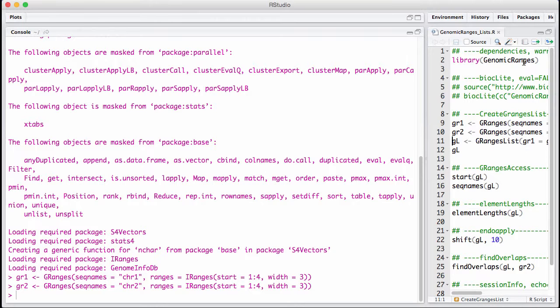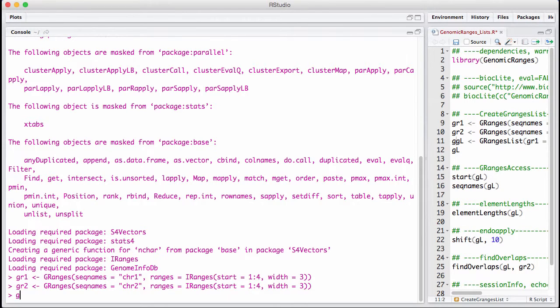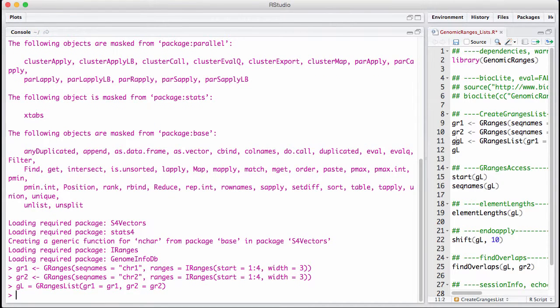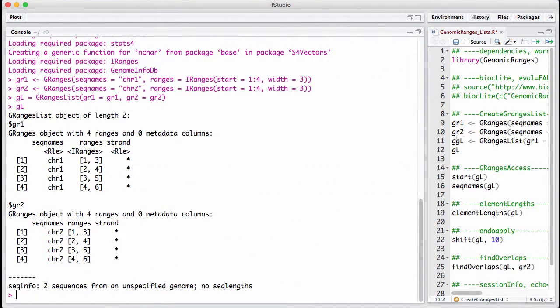And now I'm going to do a gRangers list where I'm just going to put them in. I'm going to give them names. Now this is going to be a named list. And now we have a gRangers list. Pretty simple.